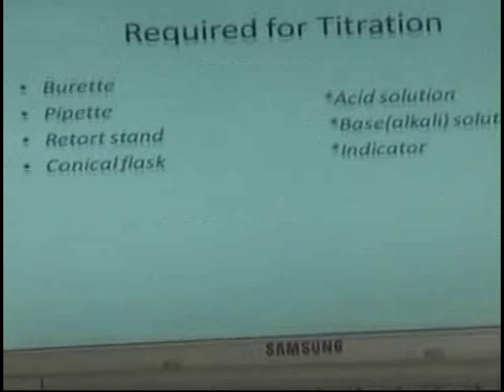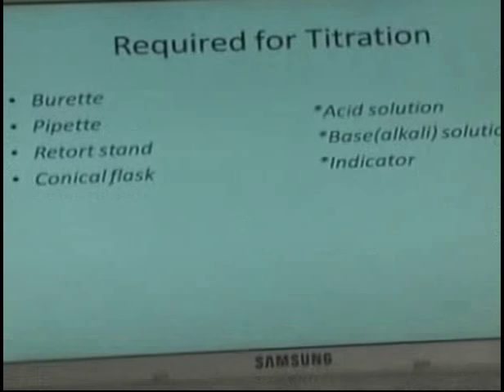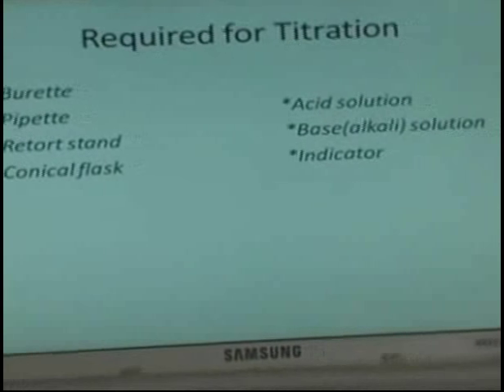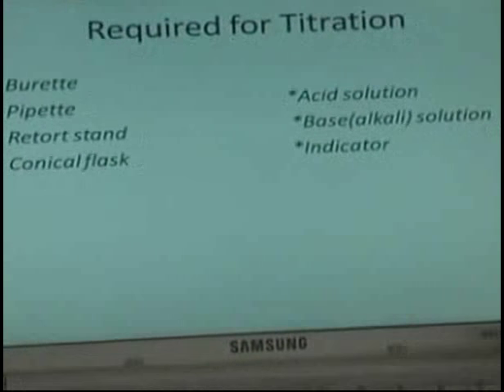Not much is required for titration. You will only need a burette, pipette, retort stand, conical flask, an acid solution, an alkali solution, as well as an indicator.